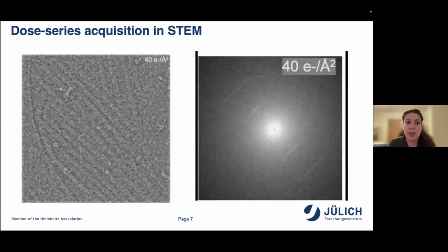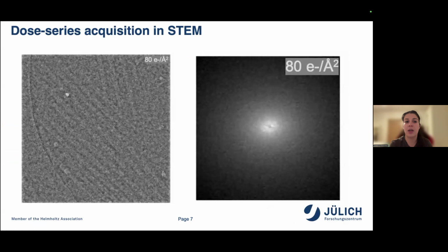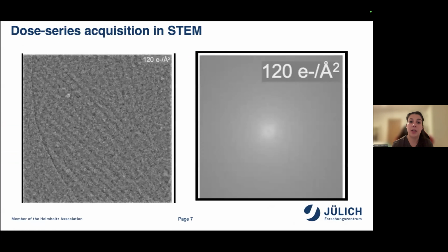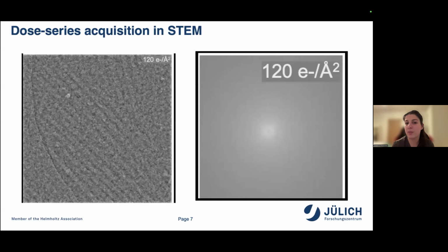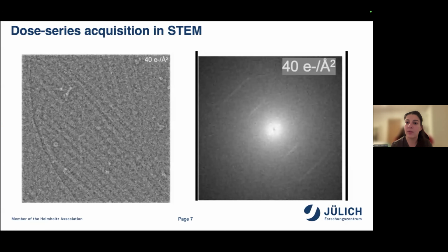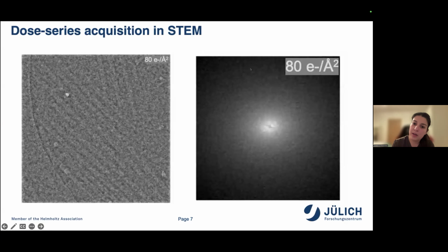Regarding dose fractionation, in cryo-EM, it's really common to collect frames and a stack of micrographs on the same area. Here we have performed the same experiment in STEM, and the electron dose of each frame is set at 40 electrons per angstrom squared. 3 frames have been captured, and you can see that as the electron dose is increasing, already from 80 electrons per angstrom squared, the high frequency layer line is fading away.